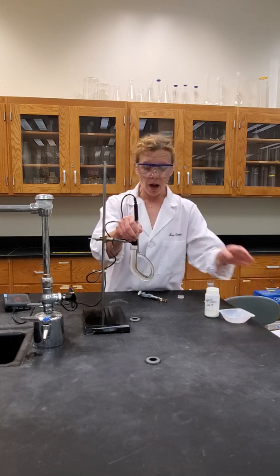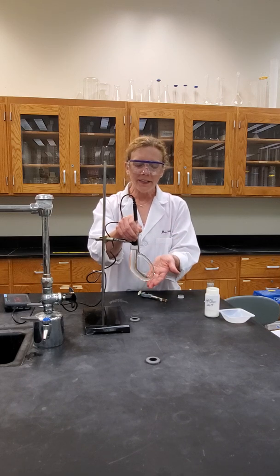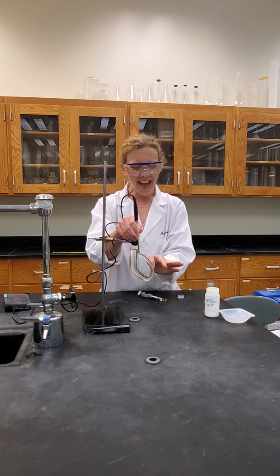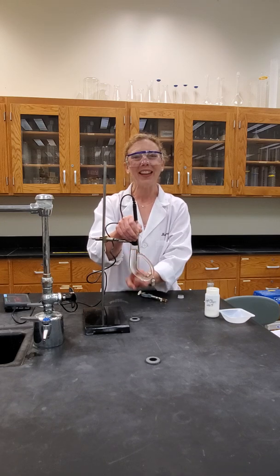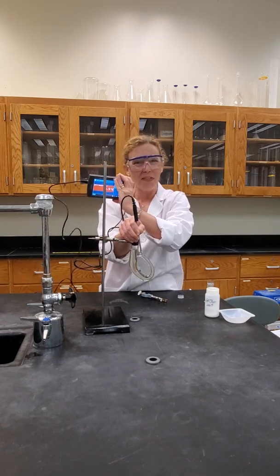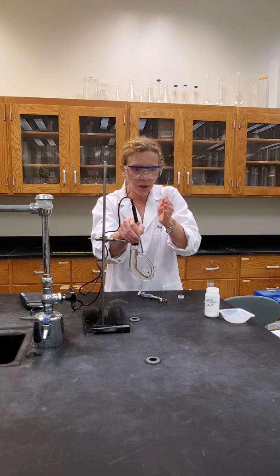The directions talked about applying your heat at this portion of your Thiel tube. We know as the mineral oil increases in temperature, it's going to expand as the majority of substances do at higher temperatures. So that increase in volume is going to lower its density, and so it'll begin to rise, but then it will cool down as it's distancing itself from the heat source and then begin to circulate. So by the time it reaches your sample, we'll have a nice, slow increase of temperature that we'll be able to see on the LabQuest reading or the LabPro screen or the attached calculator to the LabPro screen.